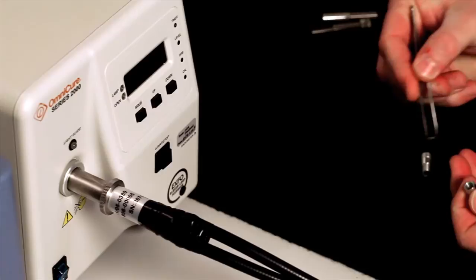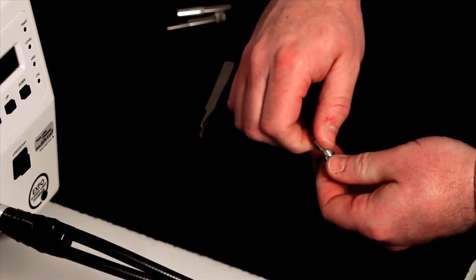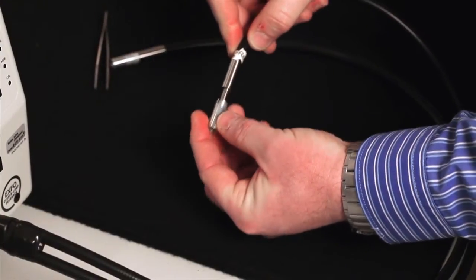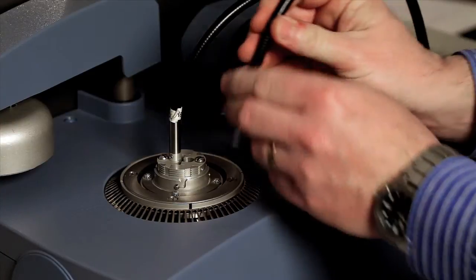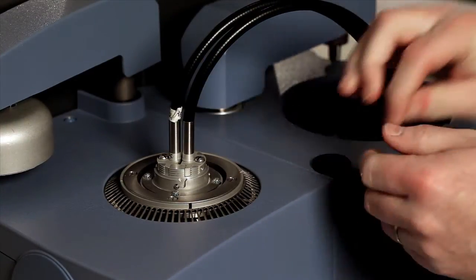The filter holders are fitted to the DSC ends of the light guides. Both have small containers into which neutral density and/or long pass filters are placed. Use matching filters for both sample and reference guides. The light guides can now be fastened into the adapter. This allows them to be fitted or removed from the adapter base as a single unit.